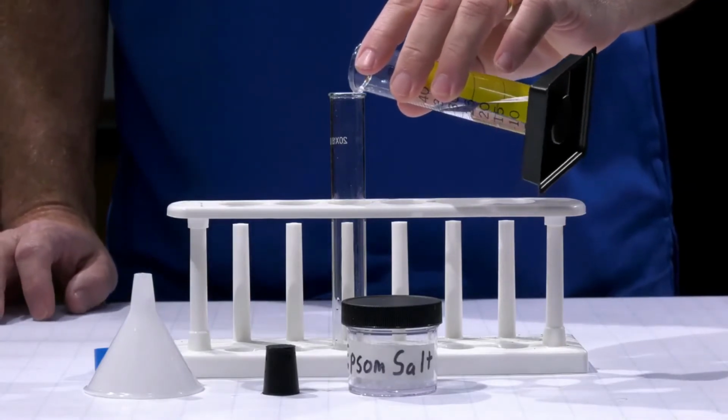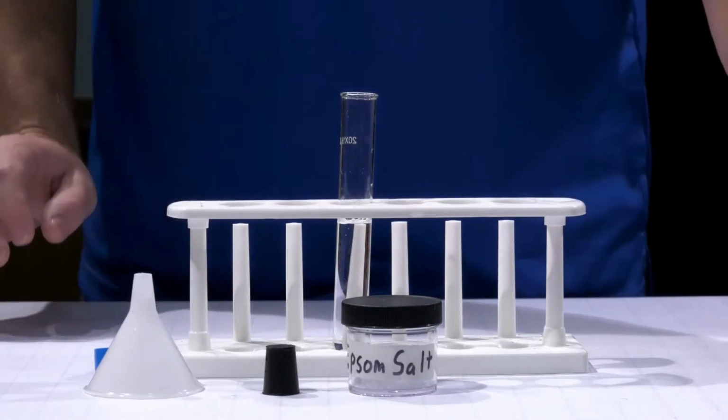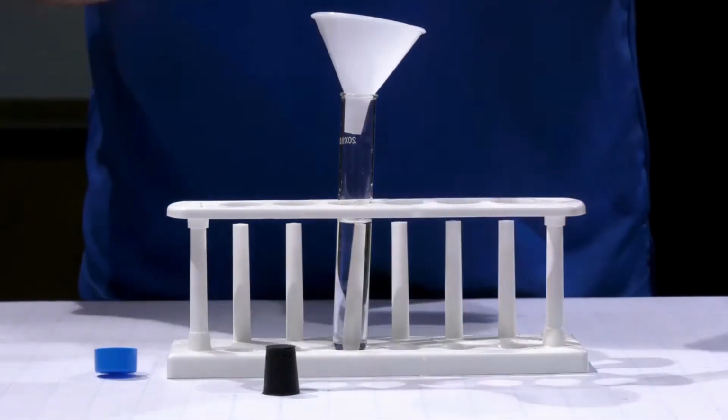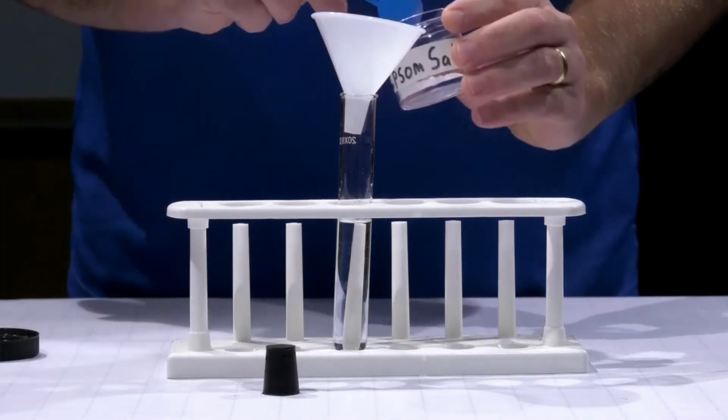So again, same amount of water. And then same amount in the scoop.